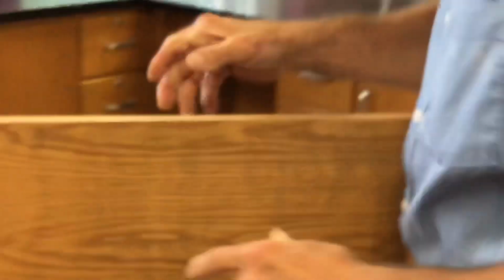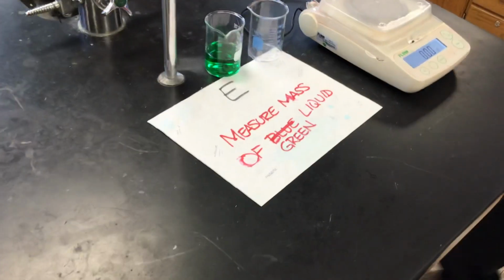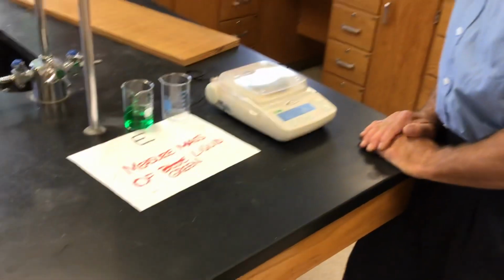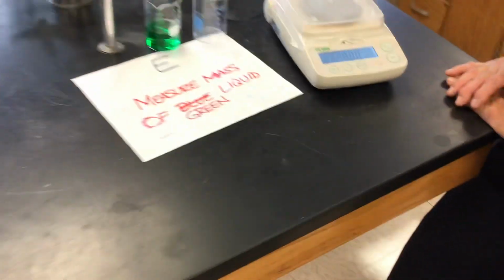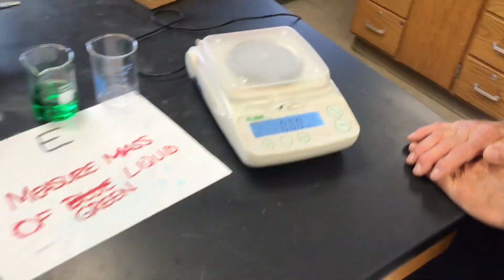All right, onward. Here's station E, and it says measure the mass of the green liquid. Usually it's blue, this year it's green. So, here we go, we have our digital scale here. Now you may remember the other day we looked at 3 different digital scales.